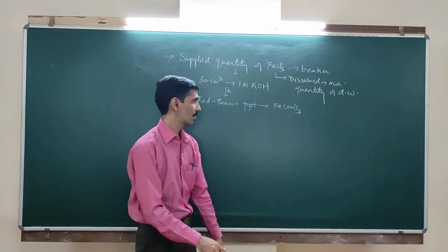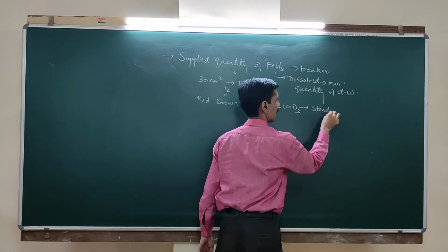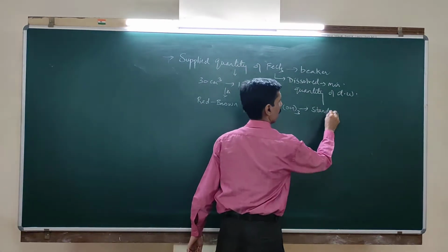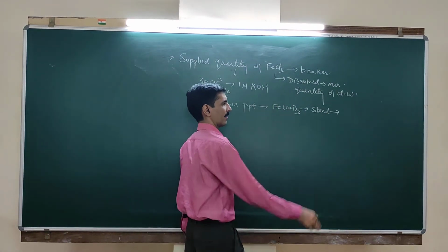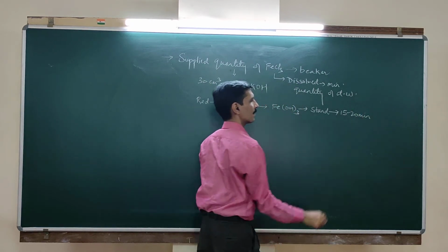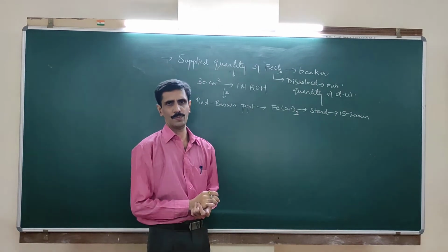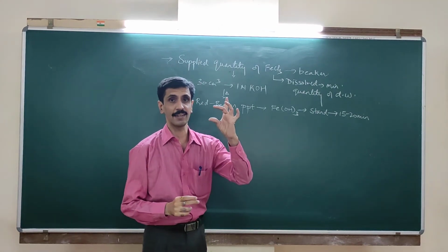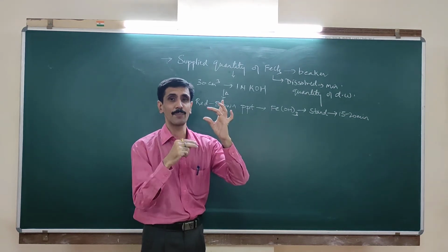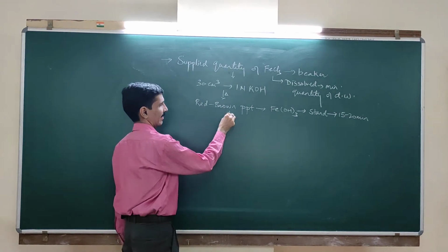So what you do is, you make sure that the PPT stands as this for few times, that is say around 15 to 20 minutes. And as a result of which, all the precipitate will settle down and you get a supernatant solution. The solution which is at the top, and that is going to be what? Clear. And that is supposed to be what? Composed of KCl. Okay?